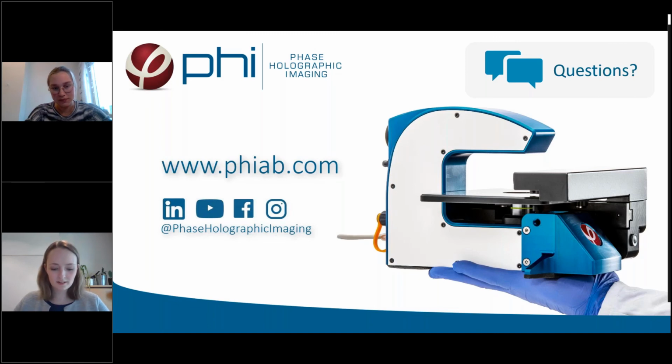So if you run the HoloMonitor Single Cell Tracking assay, are the cells spent, or what can you do with them afterwards? Can you use them again for additional downstream assays? Can you say something about that, Lisa? Yeah, I understand. It's a great question.